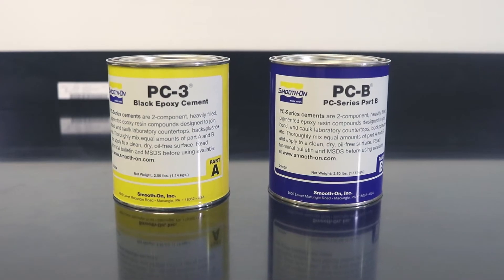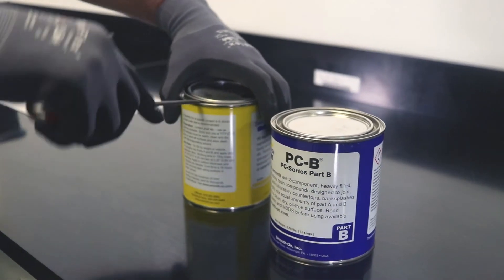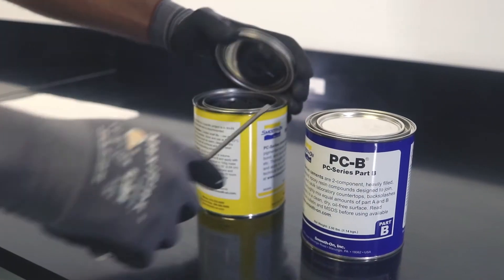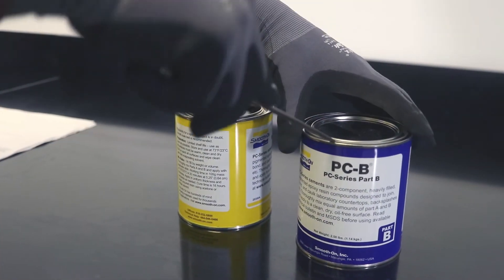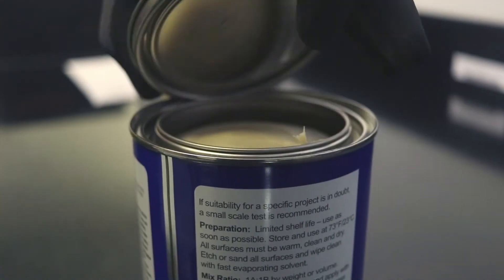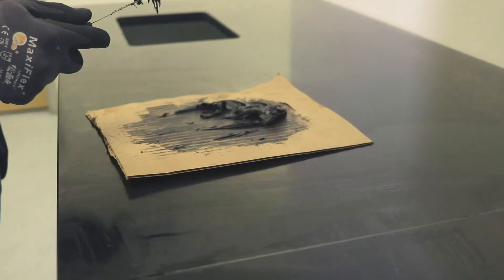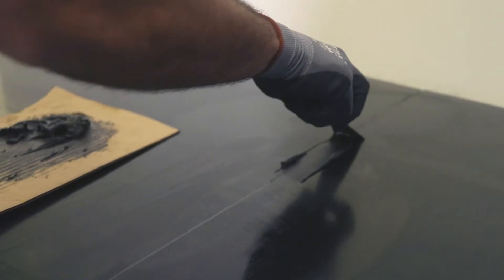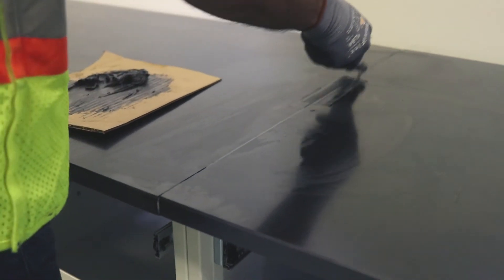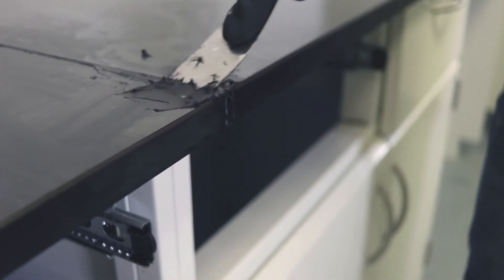Prepare the epoxy cement. The cement comes in two parts, A and B. Mix the two parts half and half on a smooth, disposable surface and use the mixture as quickly as possible. If the cement isn't used within 15 to 20 minutes, the mixture will harden and be wasted.